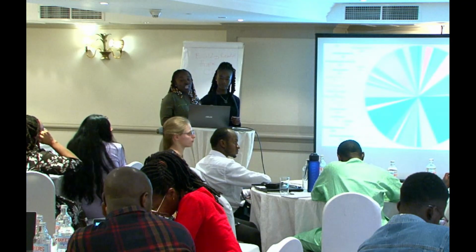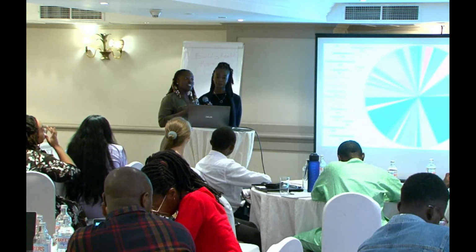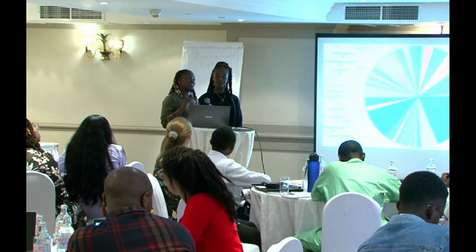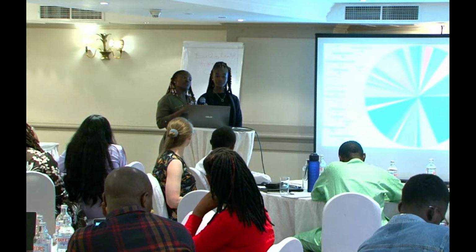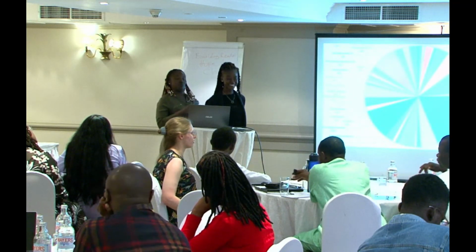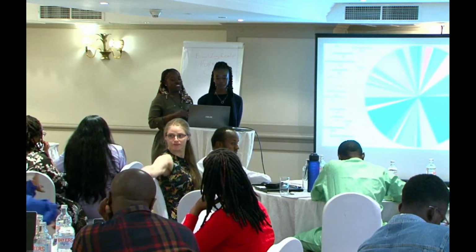Is it a good one or not qualified? Because our terpinen-4-ol is only at 19%, and they recommend it to be at least 35%, I would not use our extraction method for any commercial uses. But if you give us another year to come back, we could perfect this method and go into the commercial industry with our extractions.